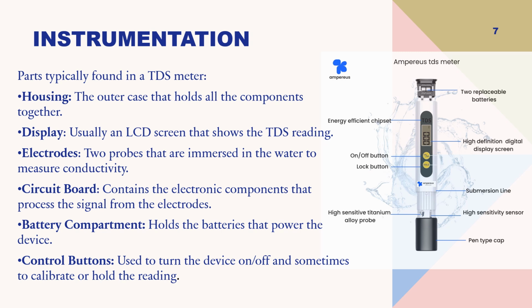In some TDS meters, there is also a thermocouple, which helps us get the temperature of the water, and it is also displayed on the LCD screen of the TDS meter.